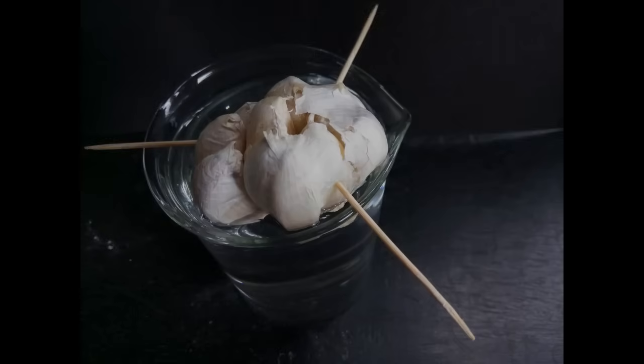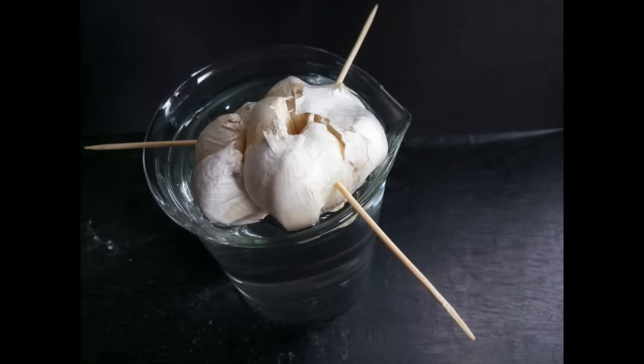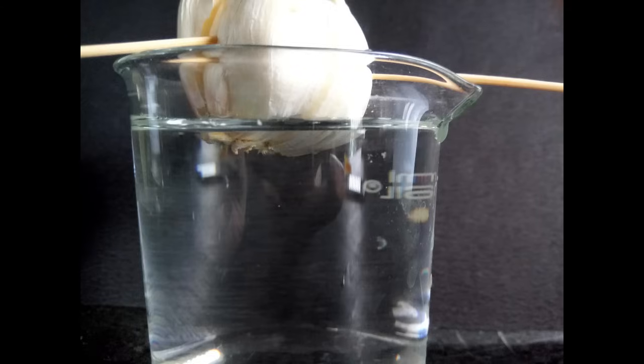To begin the experiment, take an onion or garlic bulb and fix it on a beaker containing tap water using toothpicks, like you see here. Make sure the base of the bulb touches the water level. Keep this in a safe corner for a couple of days.